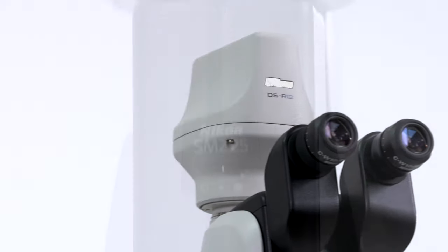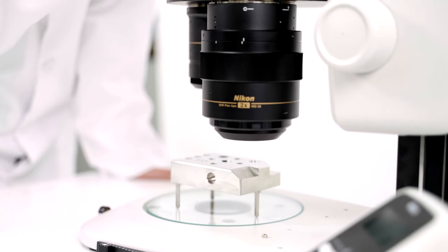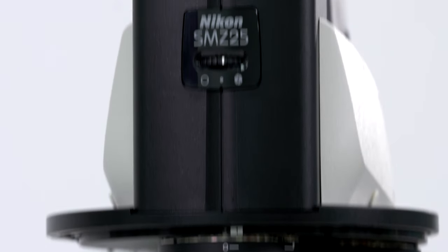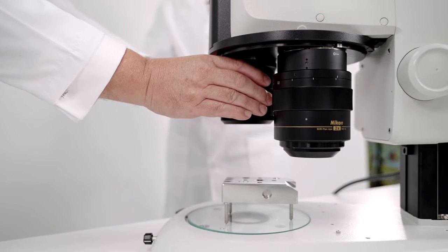Secondly, having both left and right eyepieces sharing the same resolution and image quality, a sample's features are accurately represented and recorded without any compromise at all. Thirdly, when an objective revolver is used with a 0.5x and a 2x objective, the SMZ25 provides an incredible 100 to 1 ratio for the magnification range, all done with only a twist of the turret and a push of the zoom button.